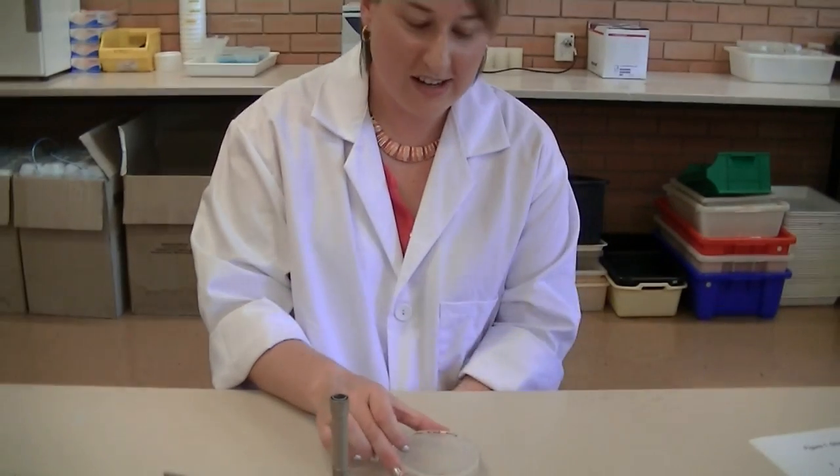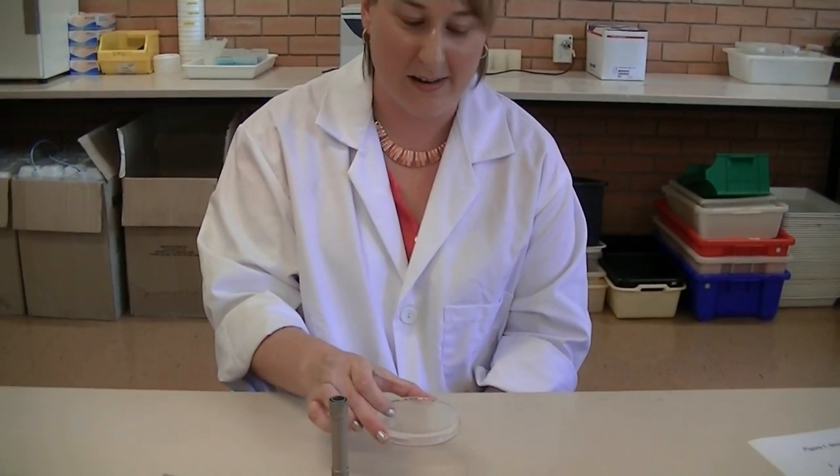For incubation, you need to place your plate upside down. That's to ensure that no condensation forms on the lid and drops onto the surface of your plate, which can actually contaminate your sample.